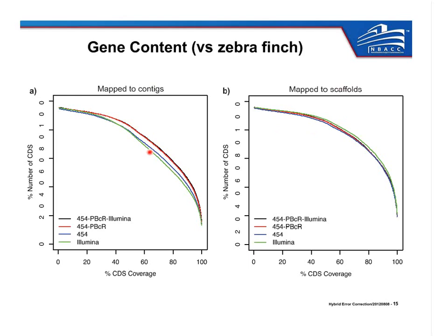So here we're looking at contigs. This means where you're able to assemble the exons and the introns between those exons accurately, and not just fill it in with Ns because you didn't know what the intron looks like. And when we look at this metric, you can see that the assemblies that include PacBio, the red and the black lines here, are significantly above either using 454 data alone or Illumina data alone. So if you want to know not just the exonic sequence, like we did in this project, but the introns and regulatory sequences that surround them, PacBio data is very powerful and helps to fill in a lot of those intronic sequences that are otherwise missing from your assembly.